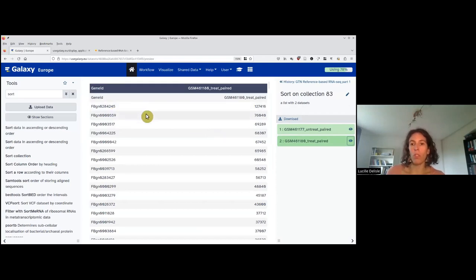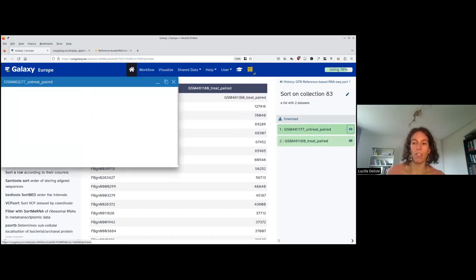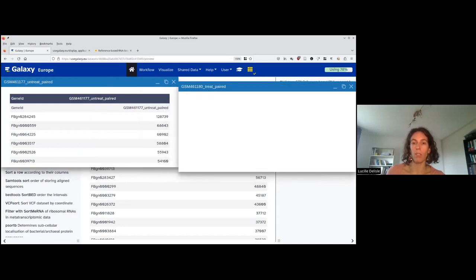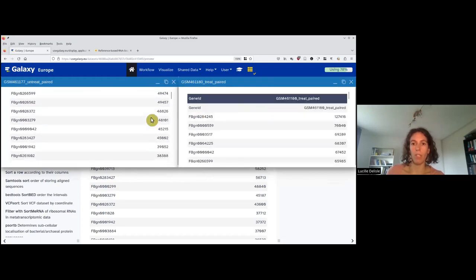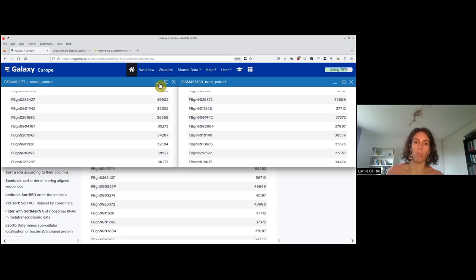Sometimes it can be very useful to see the dataset side by side. For this, Galaxy has a mode called the window manager. We click here, and then when we click on the eye, it generates a new window. We click on the other one and it generates another window. We can then move the windows so they are side by side. This way, we can scroll down both and compare. When you want to leave this mode, you just unclick on the window manager, and you can close or reduce the windows.